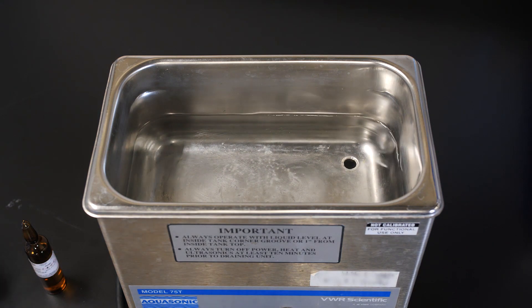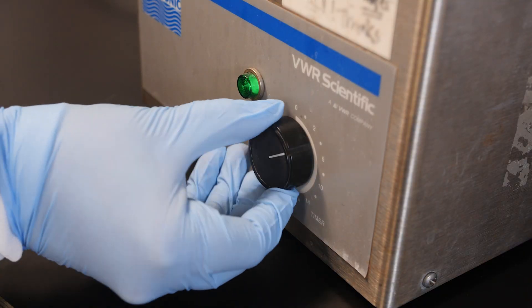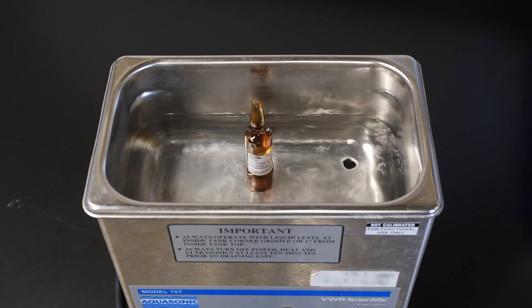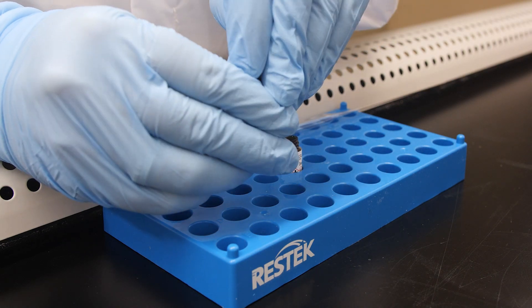Now place the ampoule into the sonicator and set it to run for 10 to 15 minutes. The sonication process does generate heat, which can increase pressure within the ampoule. We recommend that you allow the reference standard to cool to room temperature, and to open the ampoule within a hood to avoid potential splashing.